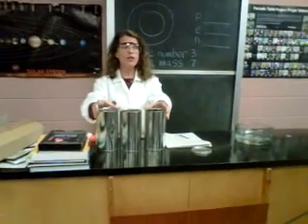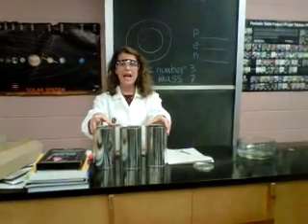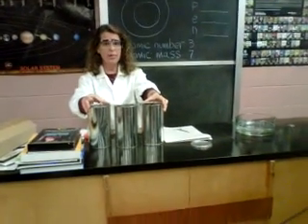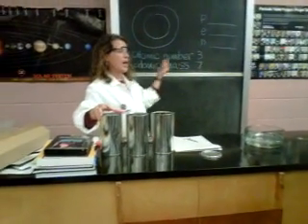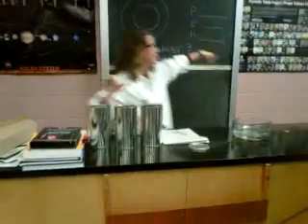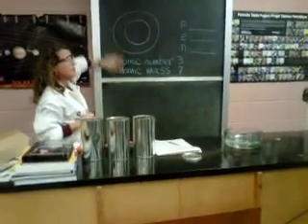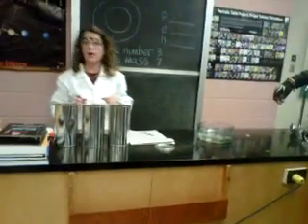Today I'm going to do a little demo with 3 alkali metals. Okay, do you remember where the alkali metals are on the periodic table? To the left. It's covered now, right? But they're on the left-hand side of the periodic table, right? Group 1, alkali metals, right?